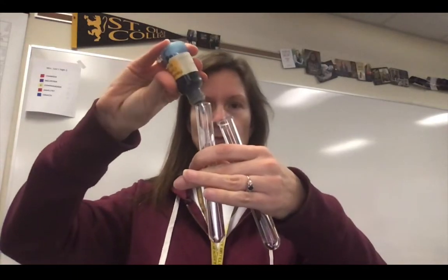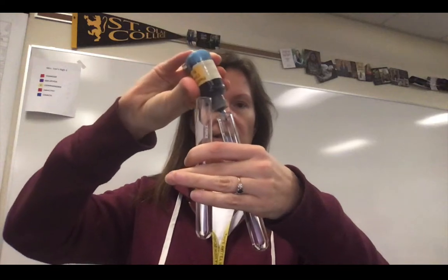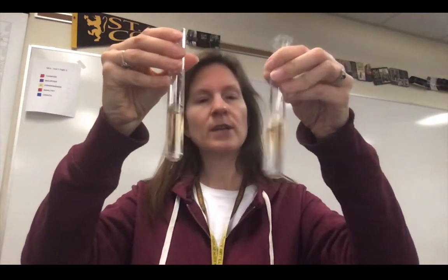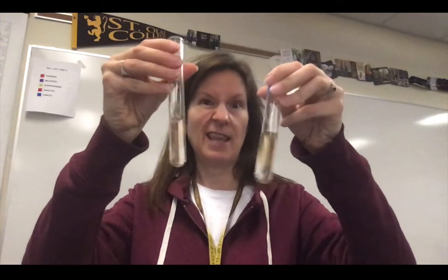The other thing I'm going to put in each test tube is something called bromothymol blue. So in each test tube, I'm going to put a couple of drops of bromothymol blue, and the background tells you that in the presence of hydrochloric acid, the bromothymol blue will turn yellow. Okay? And if there is no HCl, it'll turn blue. So that's just to help us because we can't see the HCl.